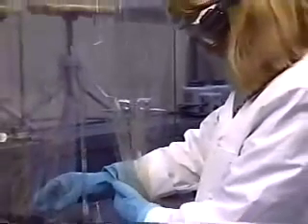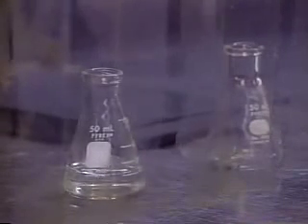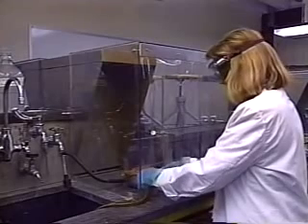Place the flask containing the dissolved benzoic acid on the bench top. Do not disturb this flask for the next 15 minutes. While you're waiting for the crystals to form, set up the apparatus for vacuum filtration.